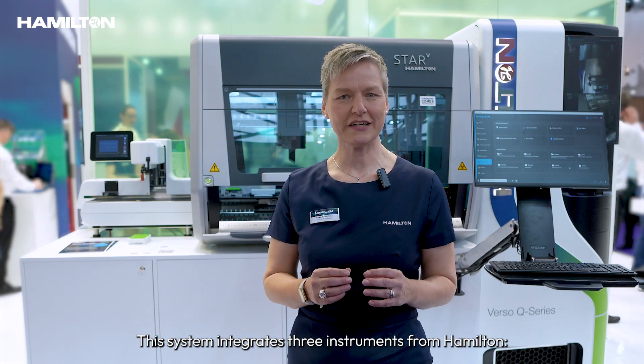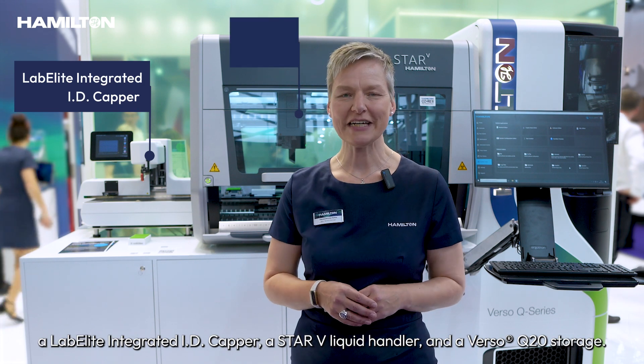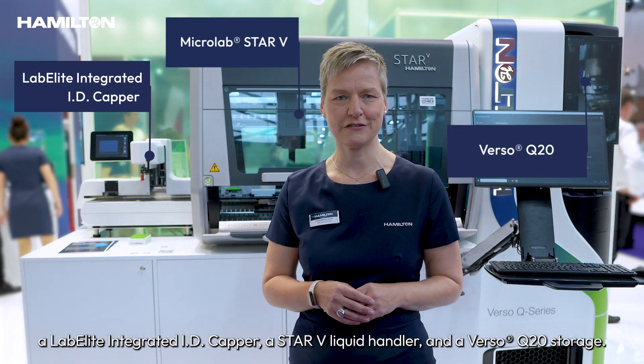This system integrates three instruments from Hamilton: a LabElite integrated ID capper, a Star V liquid handler, and a Verso Q20 storage.